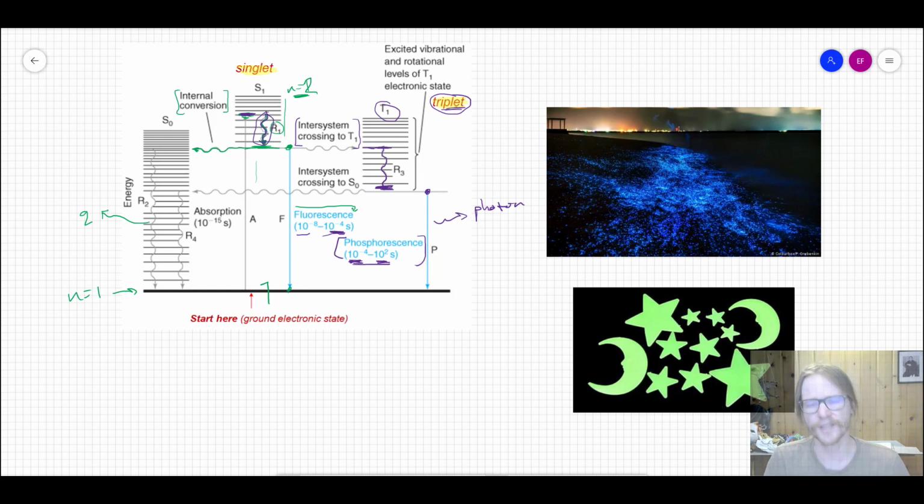So I show you these things to give you a sense for what's happening in a molecule, because I think it's really amazing. This isn't all of the story, only part of it. But I also want you to understand that every one of these mechanisms here, absorbance, fluorescence, and phosphorescence, are all possible analytical signals that we could leverage to measure something. And there are techniques associated with everything, fluorescence being a really popular one, especially if you're in the bio world, simply because it's super sensitive, and I'll tell you why in a second.